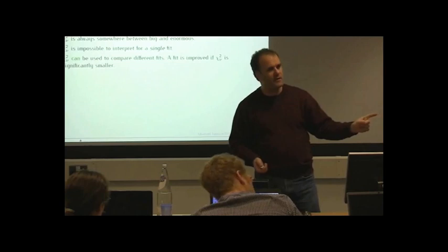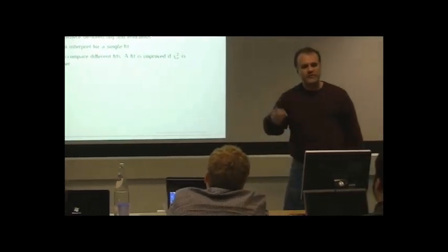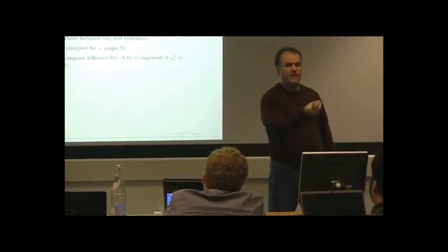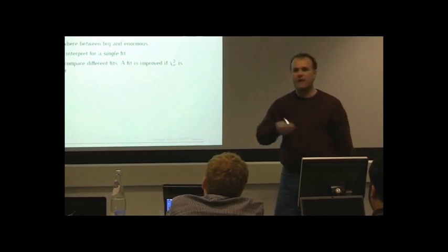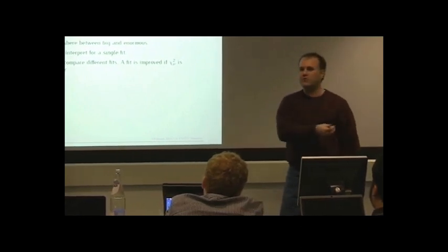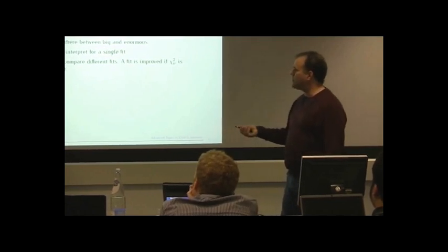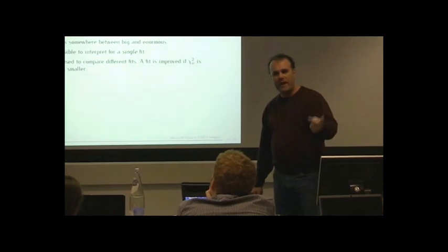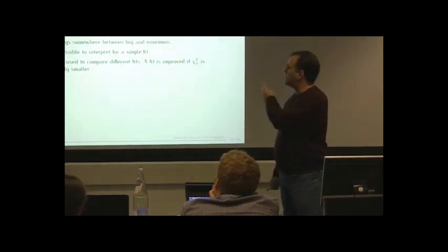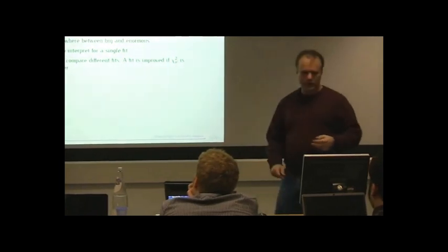And that's really the bottom line, is that we can do successive fits, changing the fitting model in some appropriate way, and know whether the change has made forward progress or has moved us backwards. So reduced chi-squared is a very useful statistical parameter, but it's useful in the context of comparing different fitting models. And that turns out to be the whole key to using IFEFIT and Artemis.